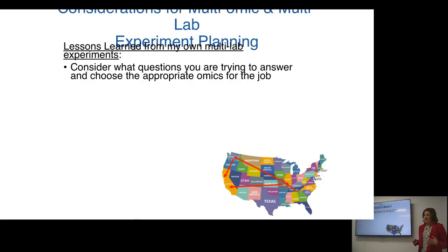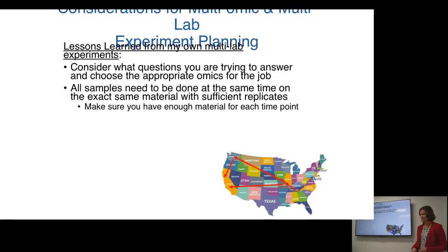You need to think in advance about which omics are most appropriate to answer your experimental question. And I see my slides have gotten a little jumbled, and I apologize. I think that was a PC to Mac conversion.